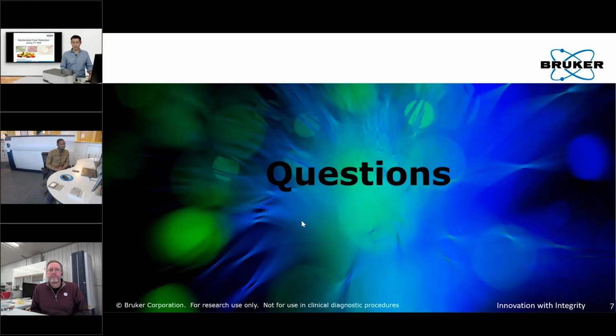Sure, I can answer that. Yes, for FTNIR you can use it for quantification. In fact, that's probably one of the primary uses of FTNIR. It's a secondary measurement, so you can calibrate it to any analytes you want, for any specific concentration of components, and build a calibration to then automatically determine the level of constituents you have in a sample.